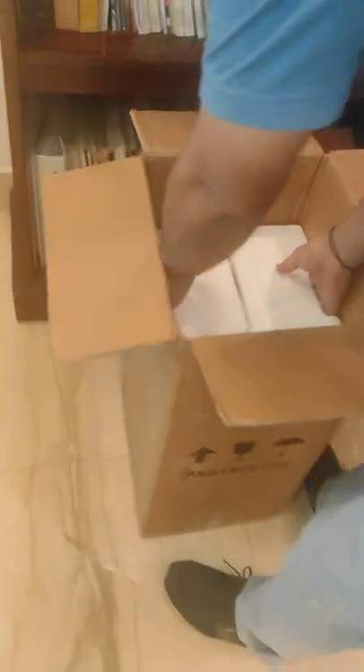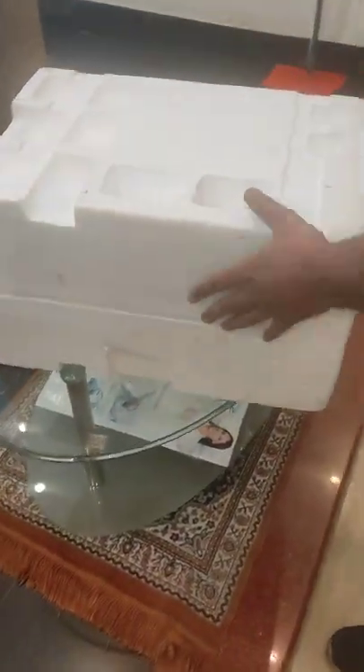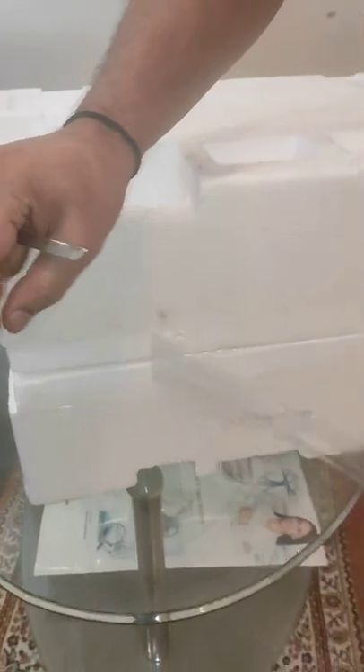This is the first section of the box. Carefully slide out the styrofoam of the microscope and place it nicely on a flat surface. All the pore sides are sealed, you need to take out the tape.